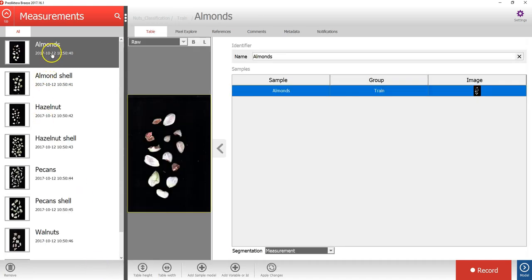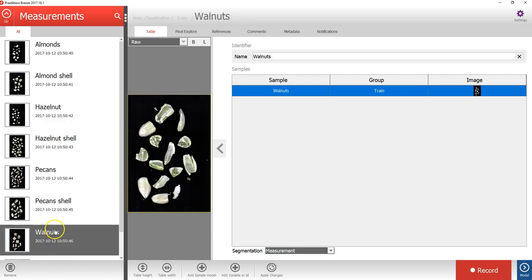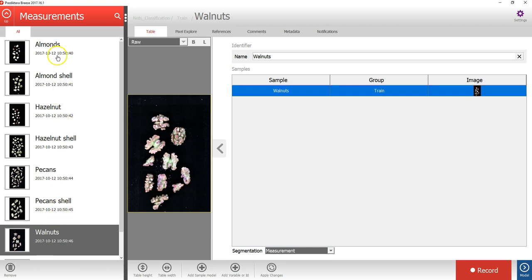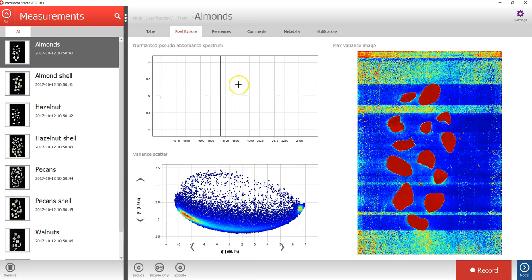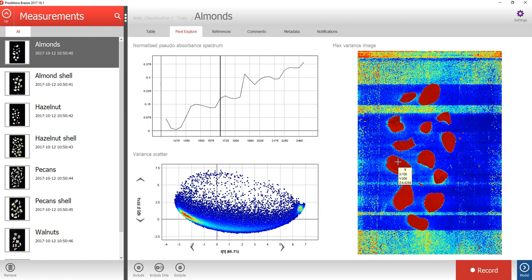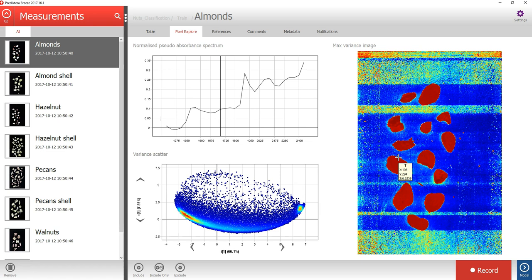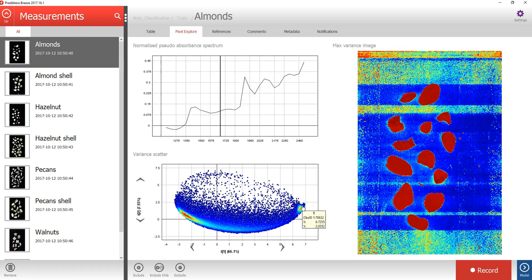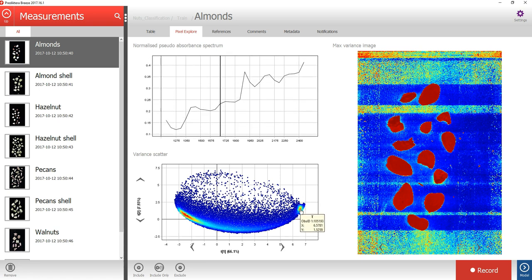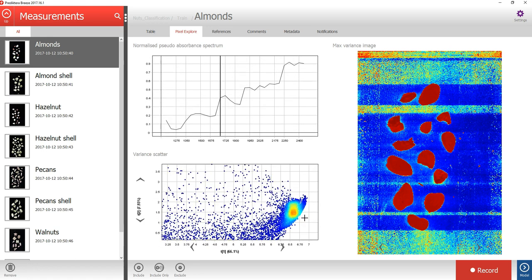In the measurement level, you can now see the individual hyperspectral images in the menu on the left side. Let's select the measurement and click on the Pixel Explore tab. To do a quick analysis of the spectral variation in the image, a PCA model has been created based on all pixels and all spectral bands in the hyperspectral image. Each point in the variance scatterplot corresponds to a pixel in the image. The points in the scatterplot are clustered based on spectral similarity, and the color is based on the density, or how closely the points are clustering together.